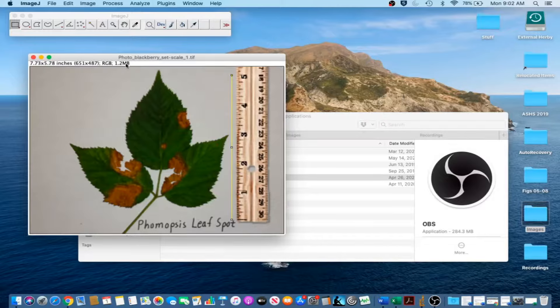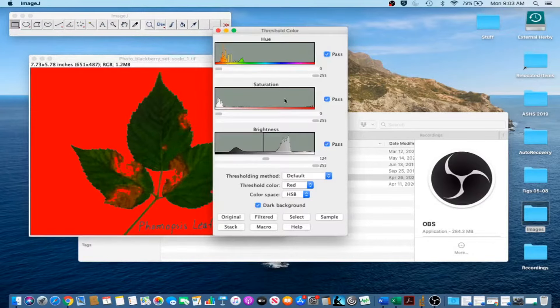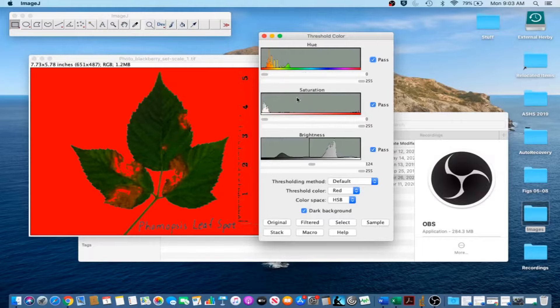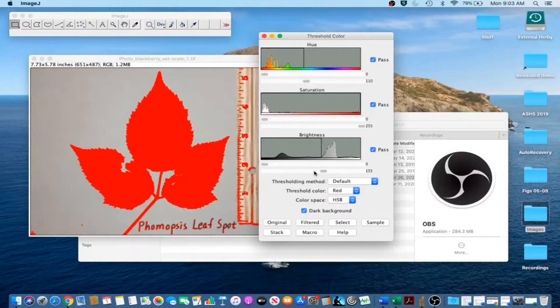The lesions on the blackberry leaf area are actually Phomopsis leaf blight. We are going to measure the total area of the leaves and then the diseased area of the leaves. With that information, we can calculate the percentage of disease damage. First, let's separate the leaf from the background. Go to Image, Adjust, Color Threshold, and adjust the hue, saturation, and brightness to select the entire leaf area. In this case, a hue range from 0 to 110 works pretty well. Then play with the saturation and brightness. These values vary depending upon the image. Click Select when you are satisfied.